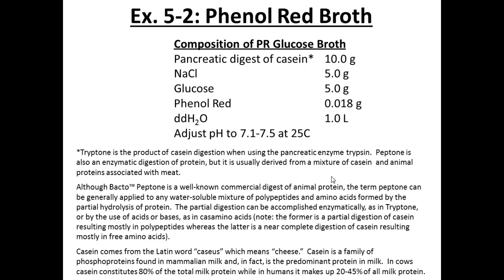Glucose first, preferably? Yeah. Preferably, most organisms are going to eat the glucose first. And this is why we talked about last time why we only incubate them for a short period of time. And I keep forgetting hers in the incubator. Her organism is kind of like me, in that it'll eat the sugar first and then it'll start eating the protein. But we want to catch it when it's eating the sugar. We want to see that it's eating the sugar and that it's not just choosing to eat the protein.